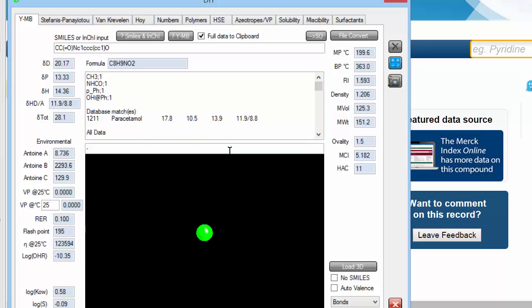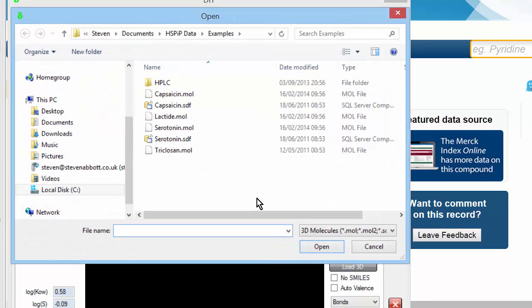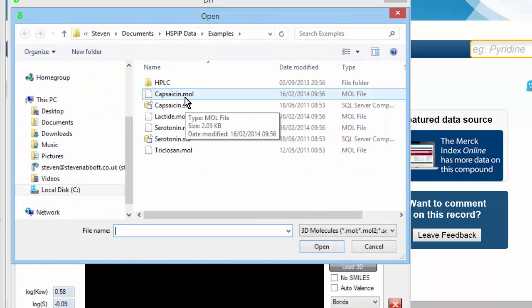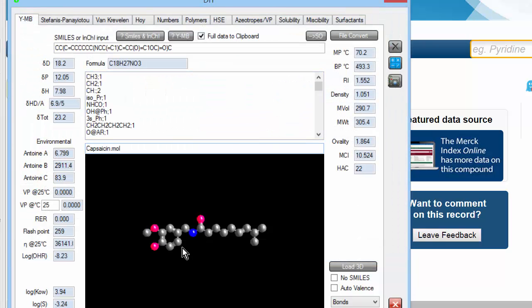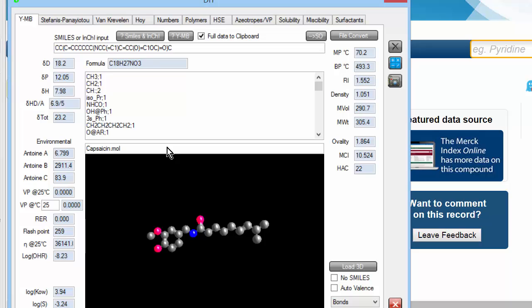You can also do it from mole files, from 3D files. Capsaicin, the molecule which gives Chile its hotness. There it is in 3D. And there's this estimated HSP.